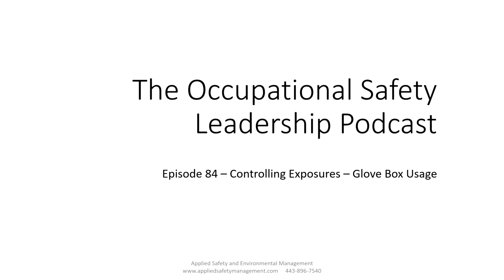One of the common faults I also find is that people don't understand what application it was even bought for, and it's just there. So people think, well, a glove box is a glove box. So you have to have some kind of a way to communicate to the workforce: this glove box can only be used for X operations, because a glove box is not going to work for every single application out there.